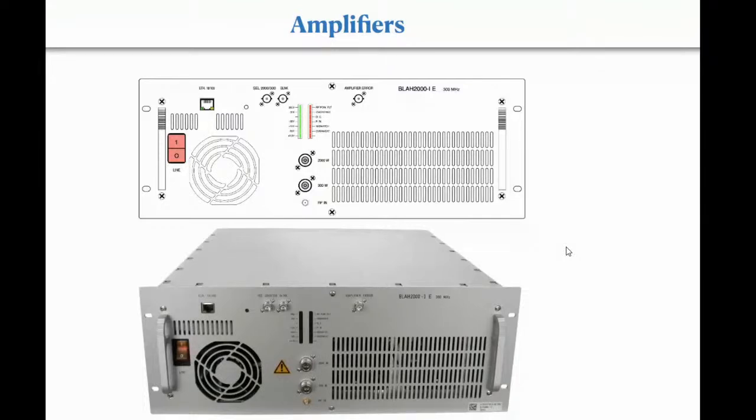So this 2000 watt amplification is required for solid state NMR. Okay, this high 2 kilowatt amplifier is required for solid state NMR. This is not really required for our solution NMR. This is a fan that basically cools it down. It gets really hot for this amplifier to work.